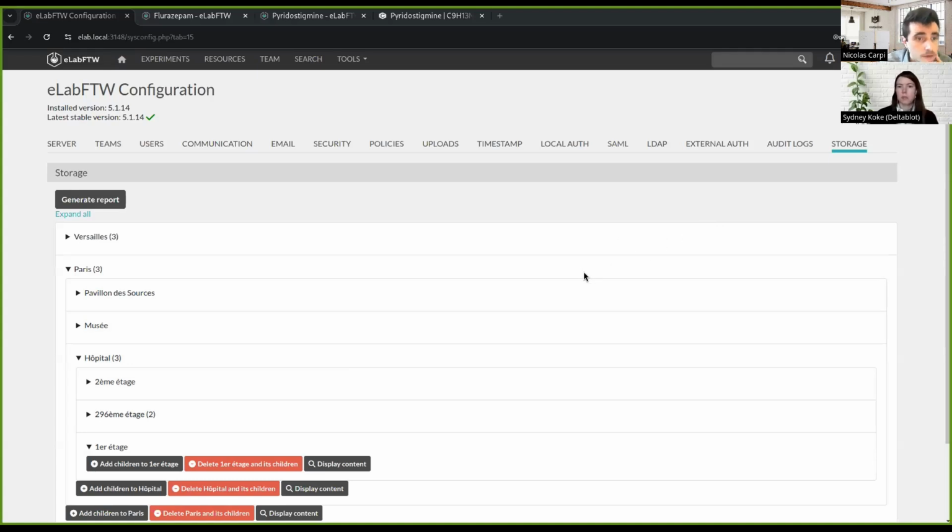John, how can you follow up the usage of your chemical? Because now you make adaptation to what is available, but you cannot follow up how much was used in the past. Yeah, it's true that the history of what was added, what was removed, I think would be interesting. For that, I guess we can have, similar to what we have for the experiments or for the resource, a change log.